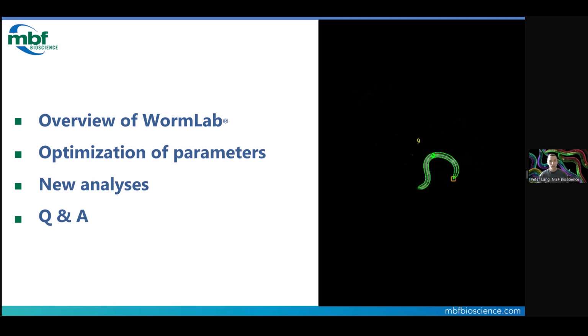Visualizing these tiny transparent worms and accurately tracking through complex movements like coiling, entanglements, or investigating effects on social interactions presents significant challenges. WormLab is up to those challenges. Today we're going to give you an overview of WormLab, discuss some parameter optimization techniques to enhance the accuracy of your behavioral studies, and review some of WormLab's comprehensive analysis tools, followed by a Q&A session.